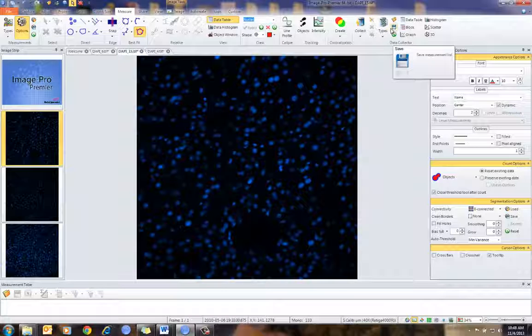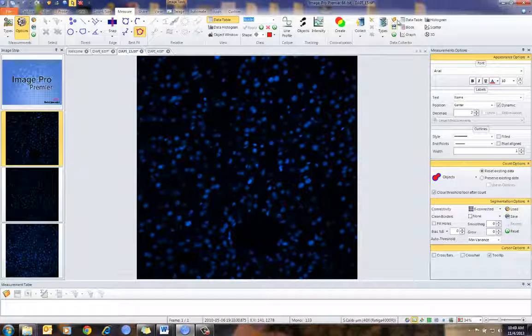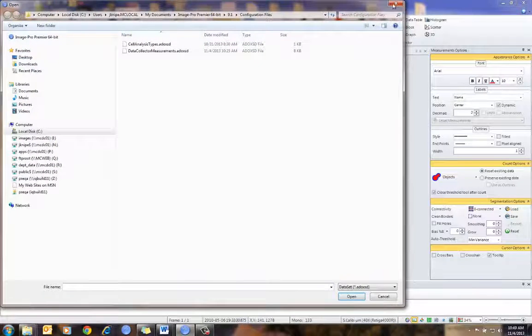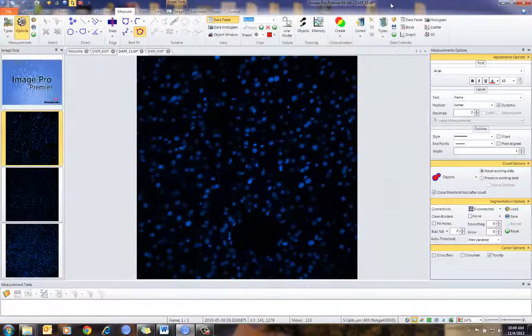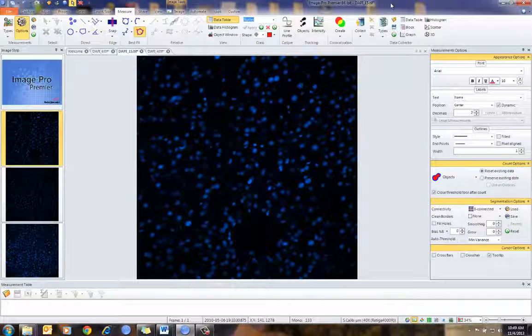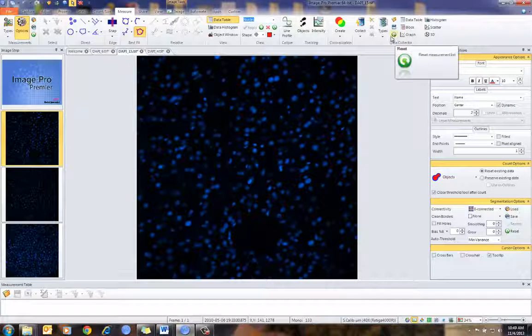In addition, we can also save our settings. I want to save my table once I have it set up, and then I can use that over and over again. I can also reload data tables and go in and reload the individual ones I'm interested in. This is very important if you're going to be using it for macros or in batch processing. We can also reset the data table, which is the button I'm going to use in a moment.